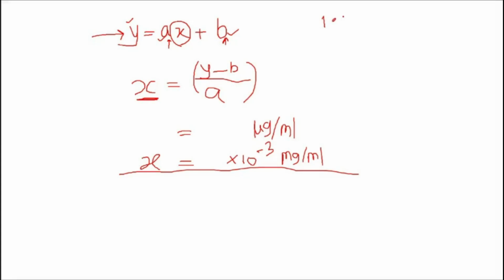How much of the sample solution did you take? You took 1.5 ml and diluted it to 25 ml. So a particular quantity is diluted to 25 ml. Can you tell me what the dilution factor is over here?